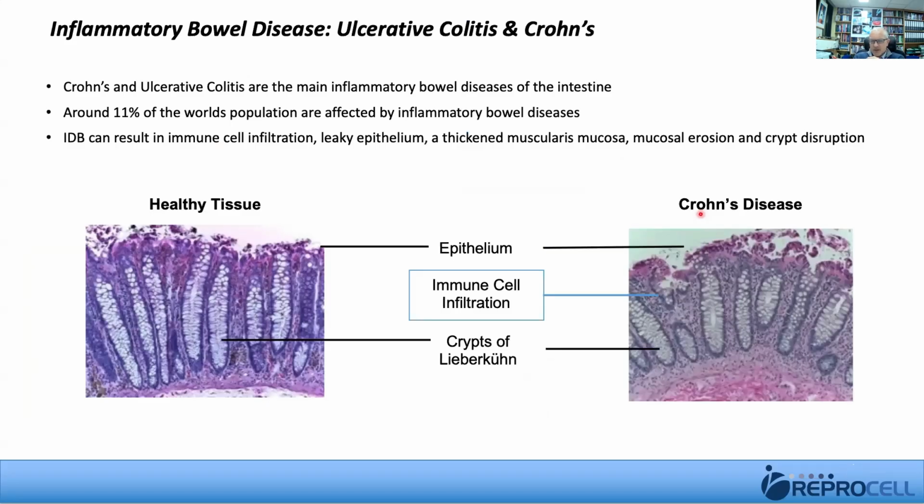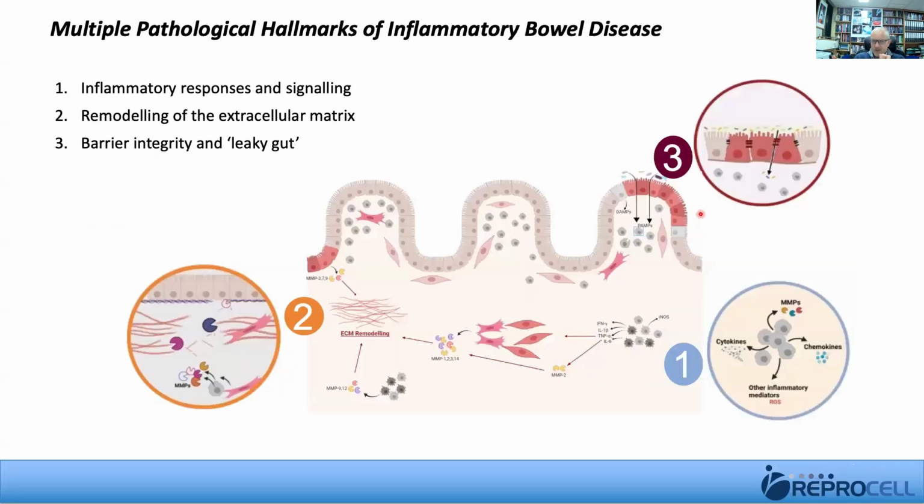But the other thing we've done here is we've also introduced immune cells into the intestinal model. And we've done that to model inflammatory bowel disease, so IBD, ulcerative colitis and Crohn's.